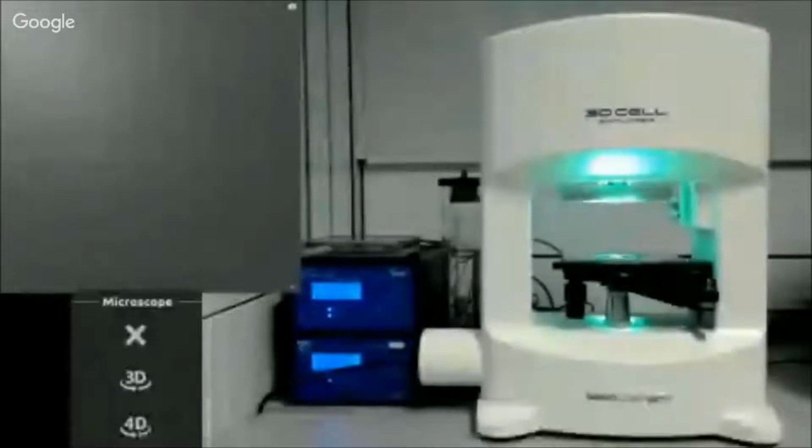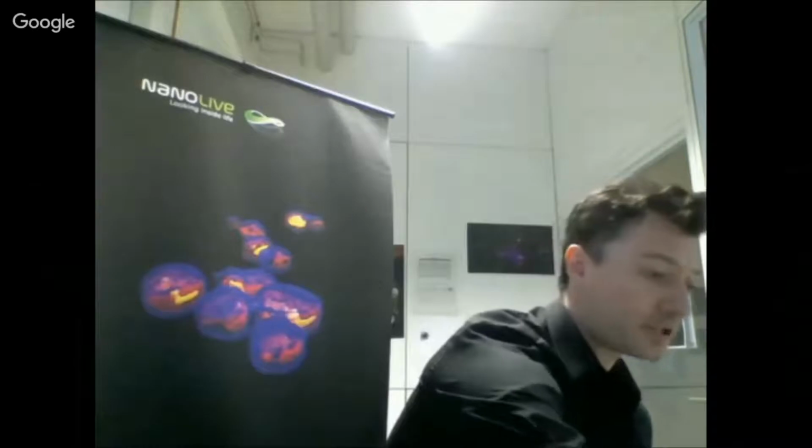And second, because I am a microbiologist, a molecular microbiologist myself. I have a PhD in molecular microbiology, and I have spent many years transfecting bacteria, inserting fluorescent genes, or doing any kind of staining that could allow me to follow up my experiment during my previous work.